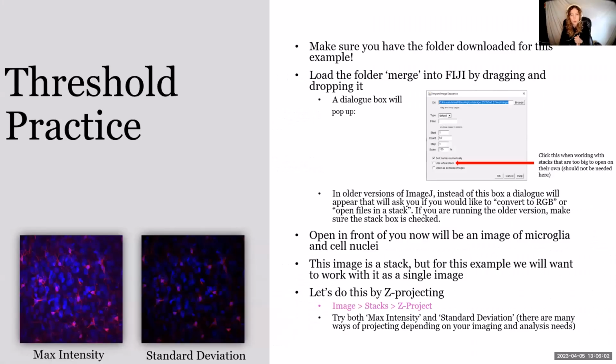The way I'm going to work through the slides that have all these instructions on them is I will first take you through them, and then I will stop the PowerPoint and actually run through them on my screen. Then I'll put the PowerPoint back up, I'll put a timer on, and everyone can work through the images themselves.